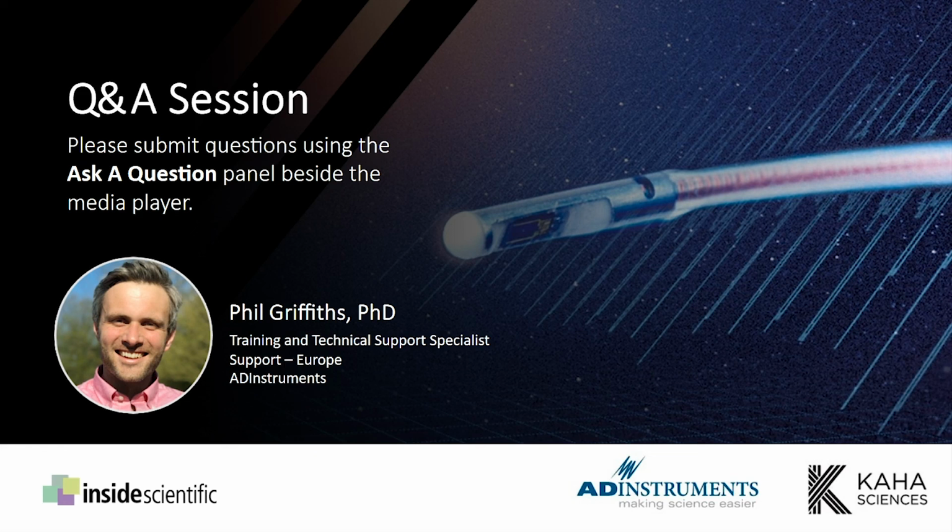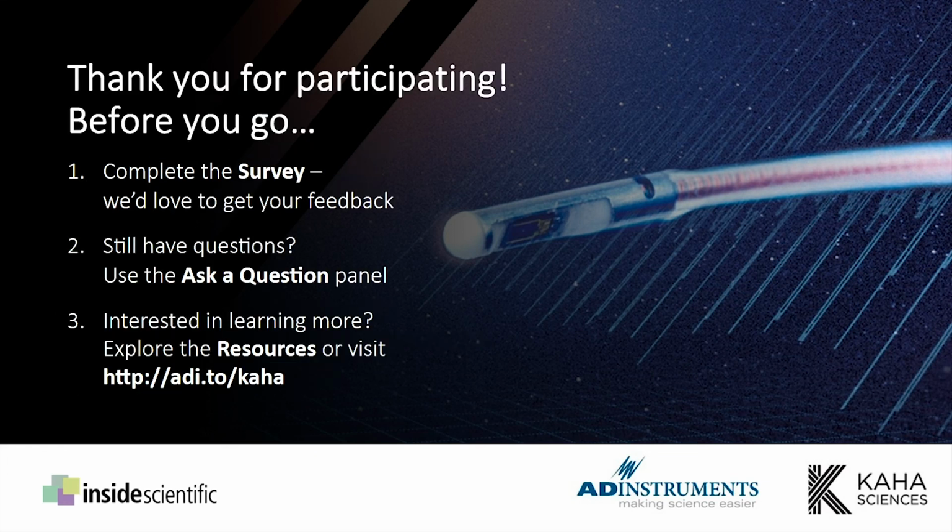Yeah, for sure. Our next question here is, is there a co-housing possibility for the mouse system? Unfortunately not at the moment. The mouse system can't work with co-housing. So the only option for that is to have an unimplanted cage mate in there with the implanted mouse.